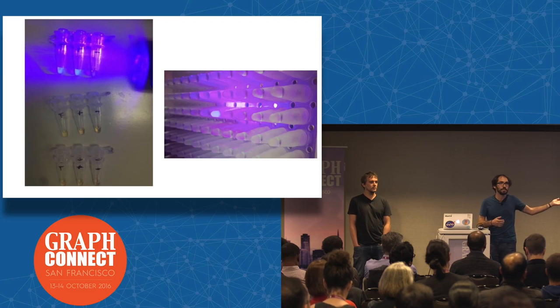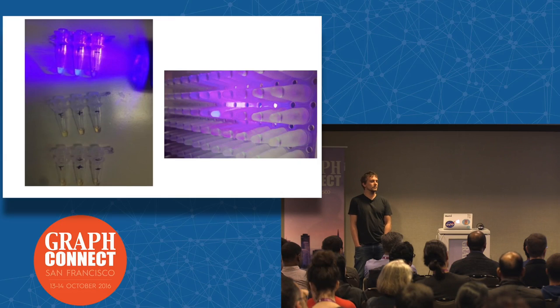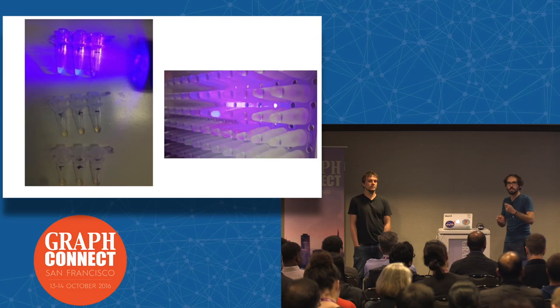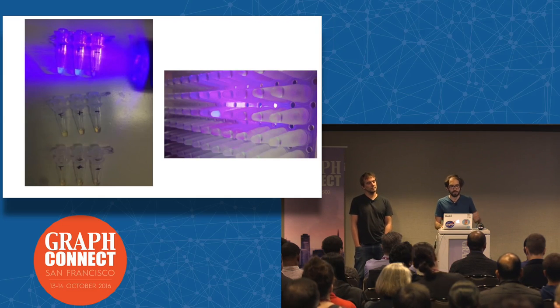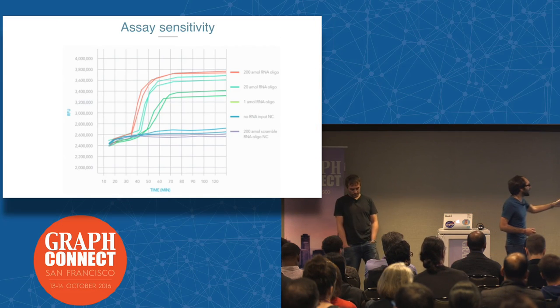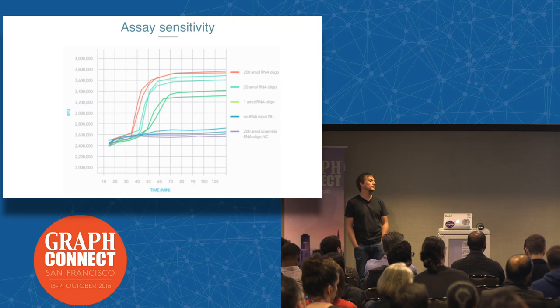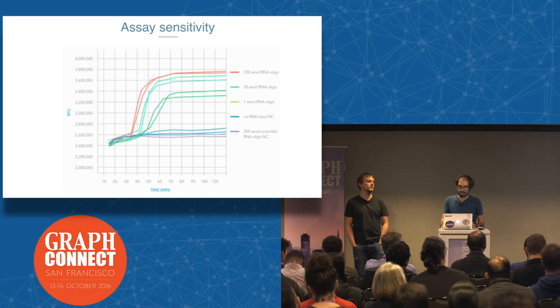So here you can see with your naked eye, imagine that each of these wells is looking for a different microRNA, and each of these wells has a specific target. When you combine the sample of the individual, if it shines after the reaction, it will shine with these UV lights. And the way it looks, data-wise, it creates an exponential curve. On the y-axis, you see fluorescence units. On the x-axis, you see time. And the sooner it shines, and also how many units it shines, we can also figure out how much of that specific microRNA you have.